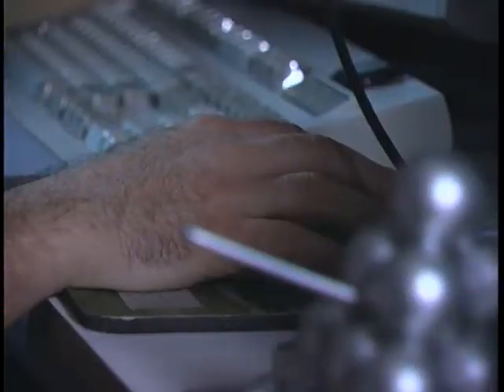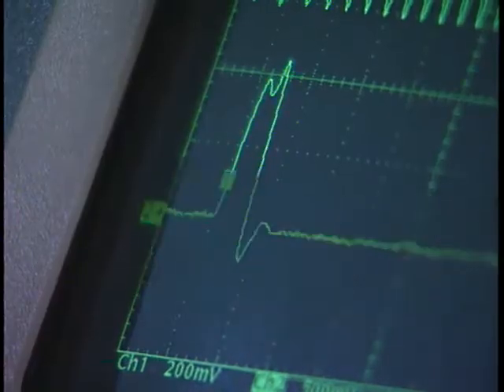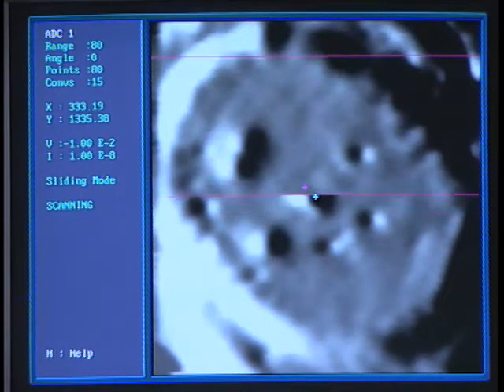We take the electrical current, or the signal corresponding to the electrical current, and put that into the stereo system in the laboratory, and we listen to that. We provide that information for our ears. Our brains are very adept at processing both audio and visual information at the same time. Our eyes are busy seeing where we're moving the atoms, and our ears are busy listening to whether the atoms are moving in the way that we think they should be moving.